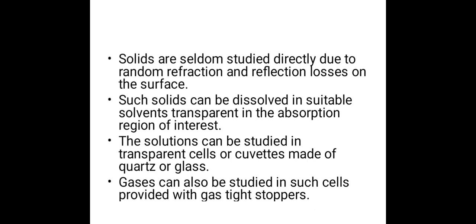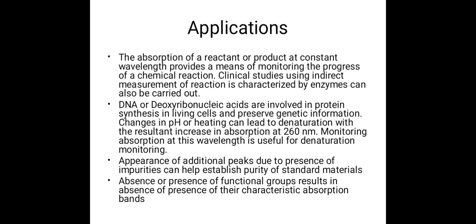Solids are seldom studied directly due to random refraction and reflection losses on the surface. Such solids can be dissolved in suitable solvents that are transparent in the absorption region of interest. The solutions can be studied in transparent cells or cuvettes made of quartz or glass. Gases can also be studied in such cells provided with gas-tight stoppers.